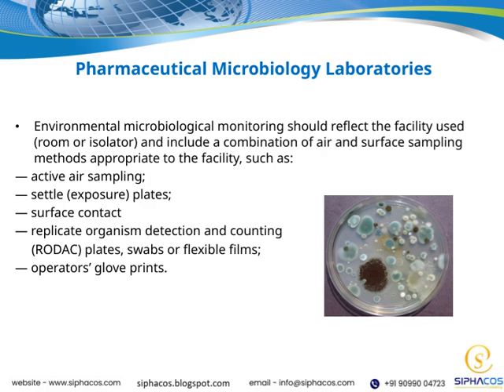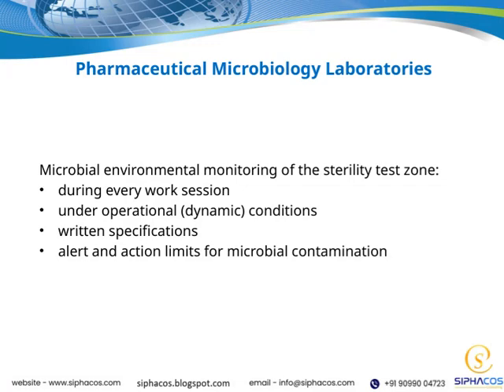By doing so, we can maintain a controlled environment, minimize contamination risks, and uphold the highest quality standards in pharmaceutical manufacturing. Let's talk about pharmaceutical microbiology laboratories and their role in ensuring product safety.